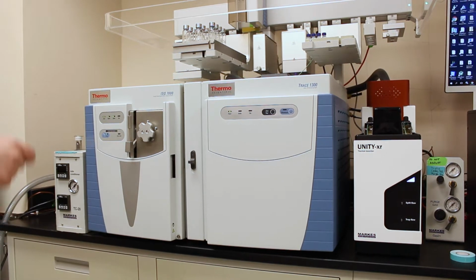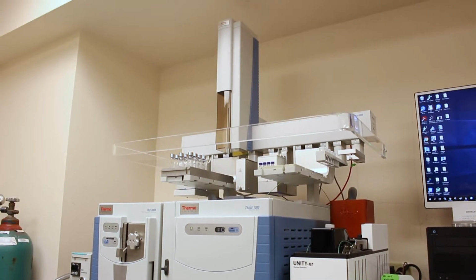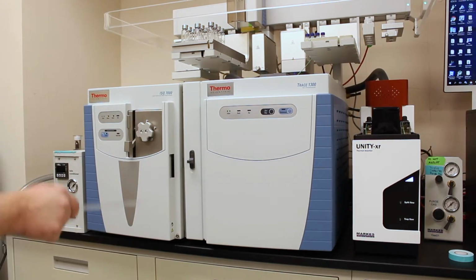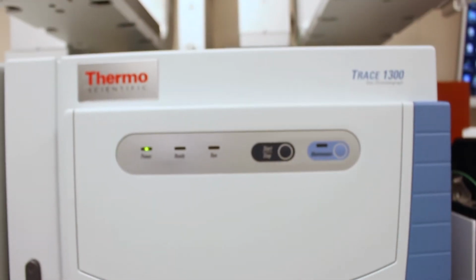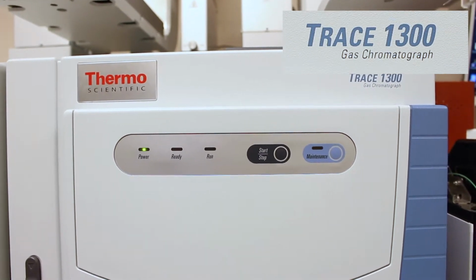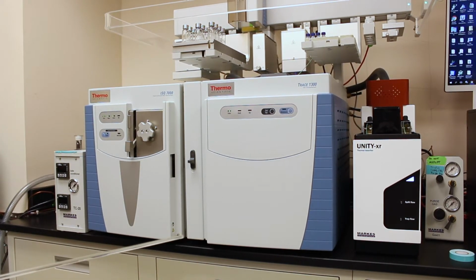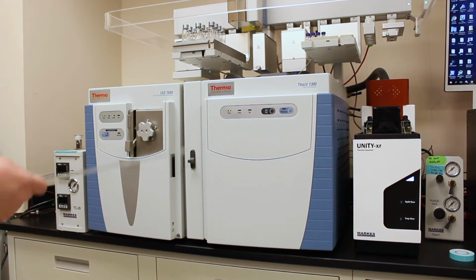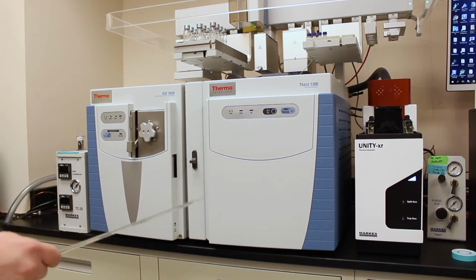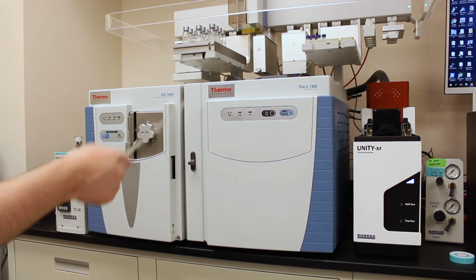So this portion is the mass spectrometer. Now, the entire instrument is called a GCMS, which stands for gas chromatograph mass spectrometer. So on the right portion here, this box is a gas chromatograph. And when we talked about chromatography, we talked about separating molecules based on their affinity for a stationary phase. So in the case of TLC, the stationary phase is basically a plate or a piece of paper. In this case, the gas chromatograph has a very long, thin column. So it's a wound column. Imagine a very thin tube, about 20 or 30 meters in length. And that column sits in this box here.